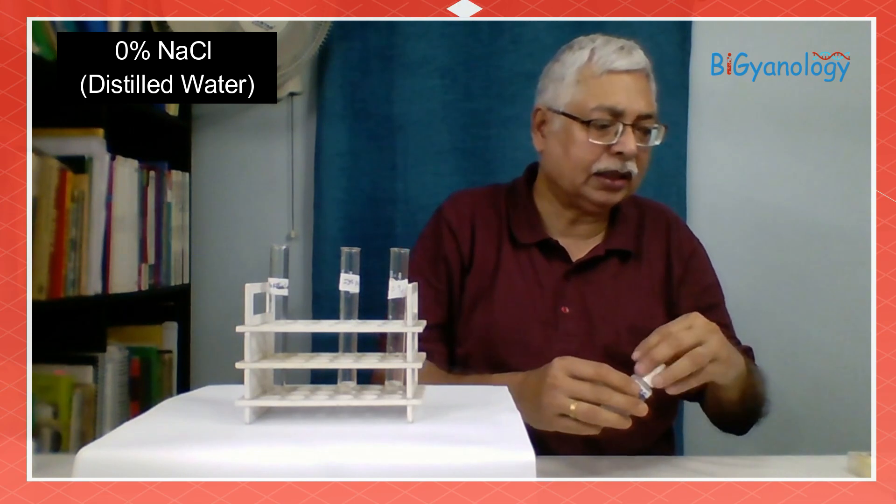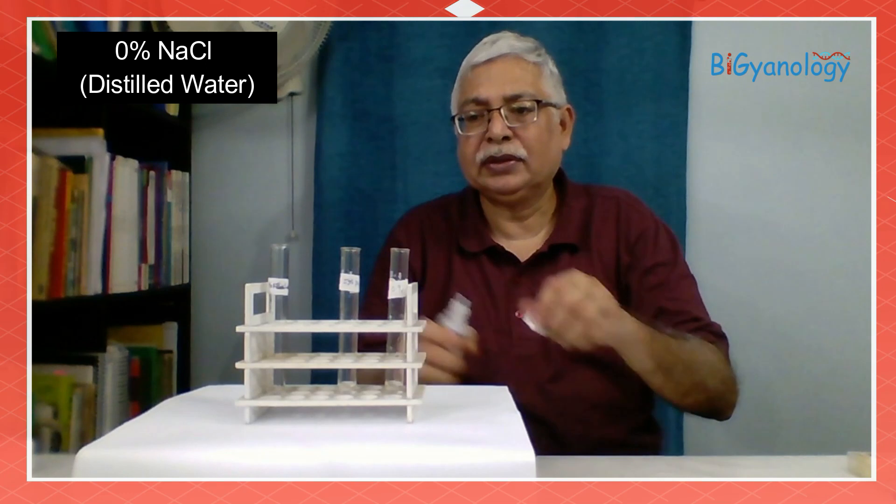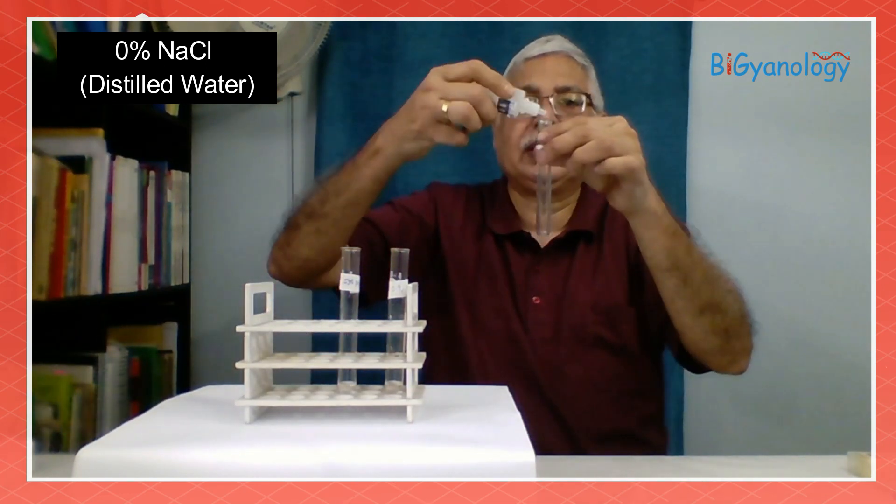In the third test tube, we are giving distilled water — same, about 1 ml.